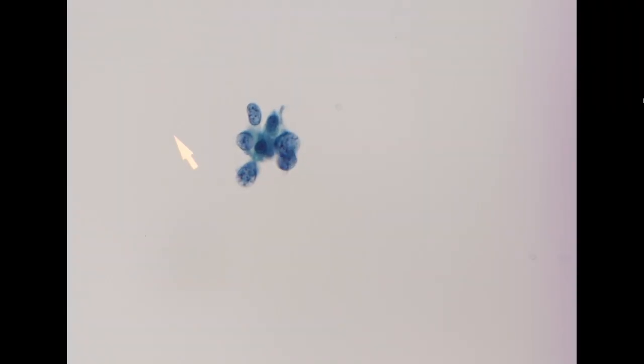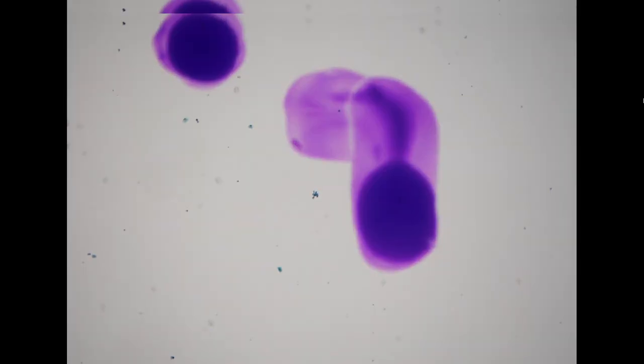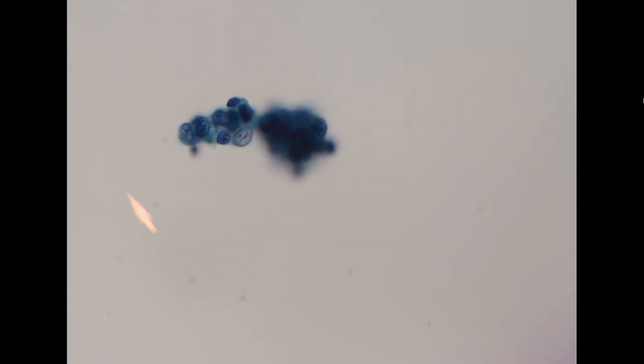So again, we have this cluster of cells, really high NC ratio, already above 0.7. And for the ureter washing cytology, usually the cellularity is not as much as the renal pelvis, because the ureter is a very tiny space. But we see almost all the cells have these high-grade atypical features. So this is diagnostic for high-grade urothelial carcinoma.